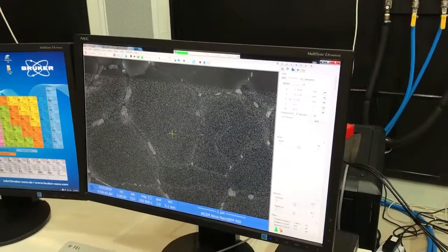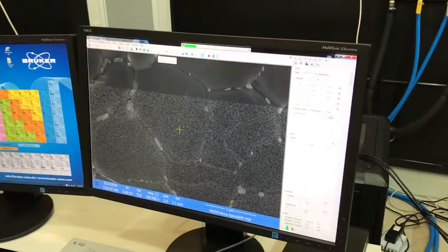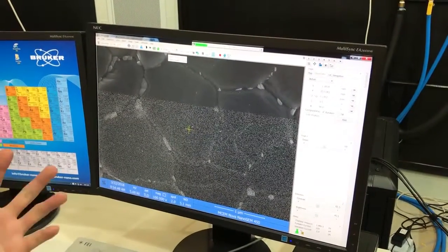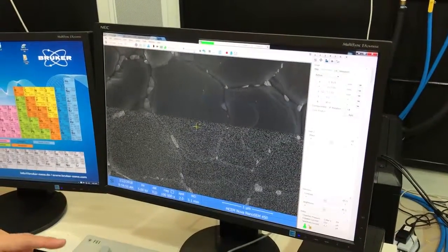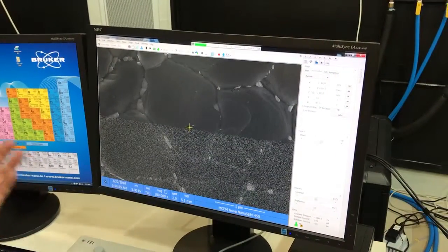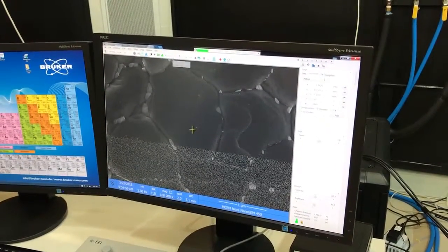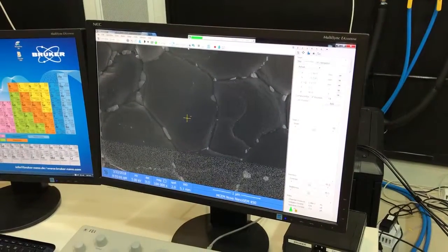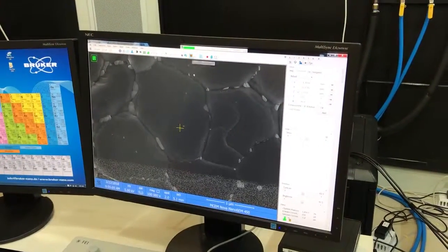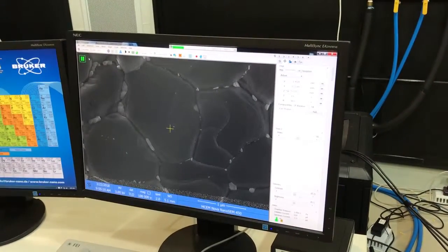Still a bit bright. Yeah, so when you are trying to acquire the image, then you can use the longer dwell time on the specimen, and you can choose the dwell time and the image resolution. So I'm now choosing 20 microseconds per pixel. What Wen Liang was doing before, when he was doing his alignments, was a very fast scan rate.